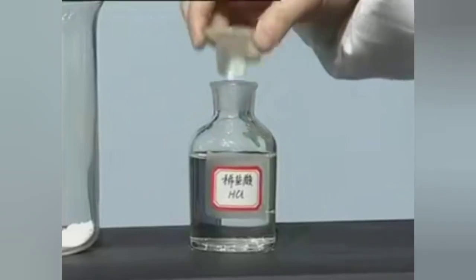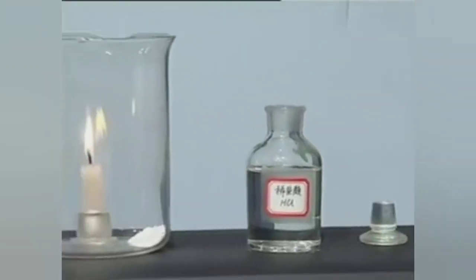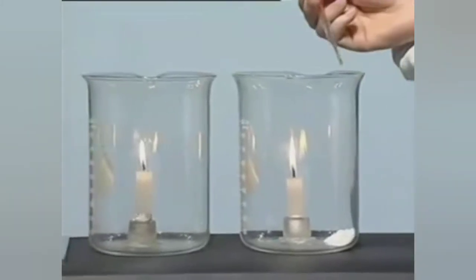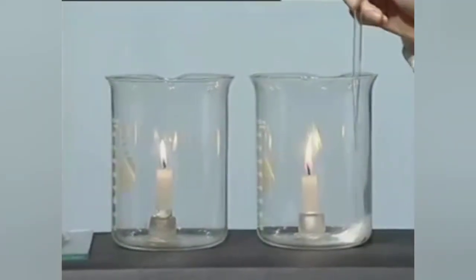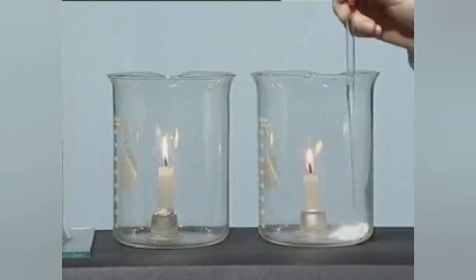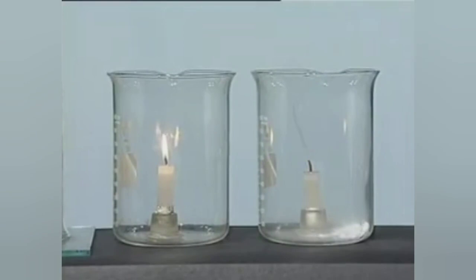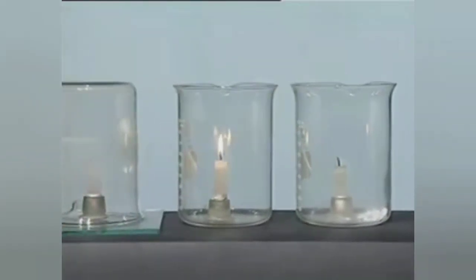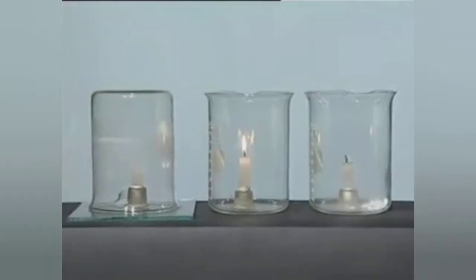Pour an appropriate amount of hydrochloric acid into the beaker filled with sodium carbonate powder. Observe that as the gas is produced by the reaction, the candle gradually extinguishes. The main reason behind the extinguishing of the candle flames is the formation of carbon dioxide gas.